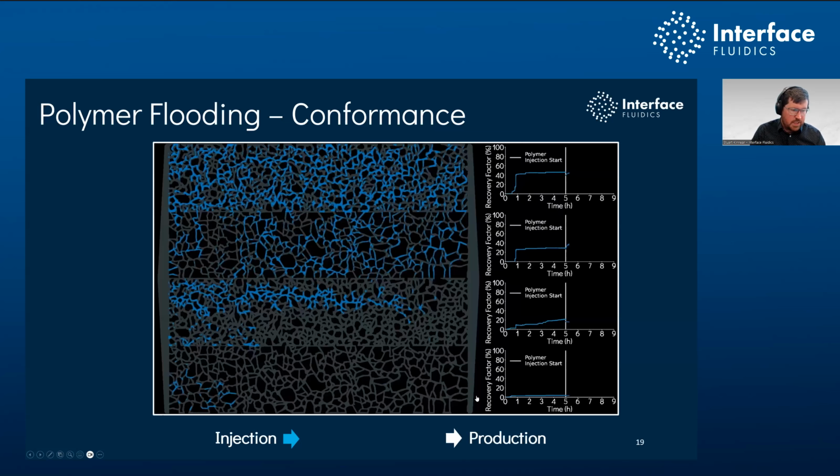If we take this to sort of the next logical step of understanding how different porous media with different fluids behave, we published a paper last year looking at how we look at multiple porous media with different permeabilities and porosities stacked on top of each other in fluid communication. So what we're looking at here is the top porous media is high perm, high porosity. The bottom is low perm, low porosity. And we have sort of a medium high and a medium low of each between. The goal was understand and quantify how we can bypass or not bypass or access additional unswept regions with different fluids.